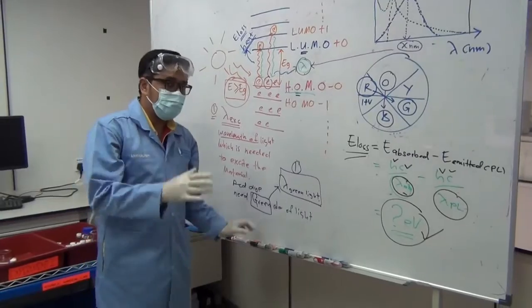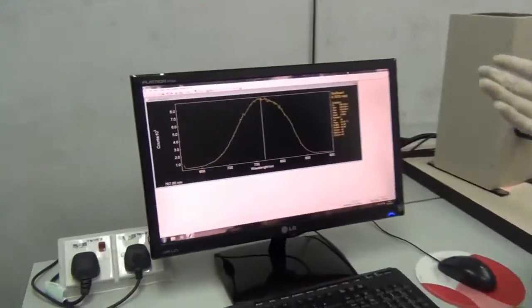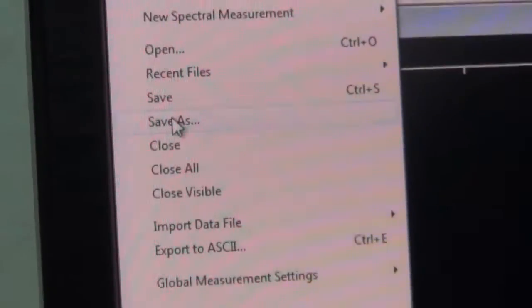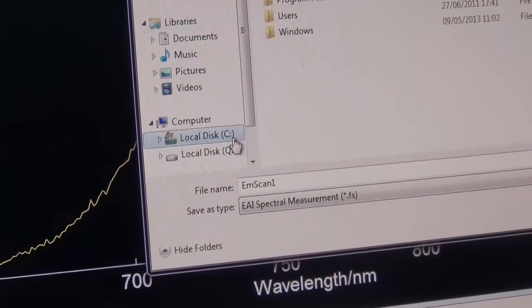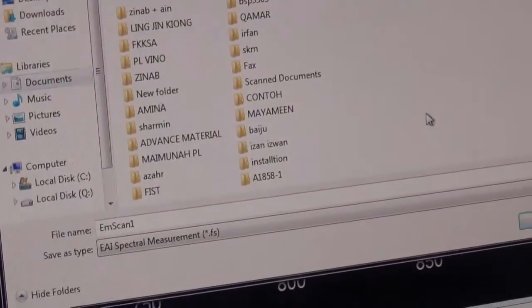Now, how to save the data? Let us turn back to the instrument. To save the data, you need to click File, Save As. Okay, go to... it's Q, not Q, sorry. Maybe C, not C. Let us check. Maybe Documents. Yes, in Documents.